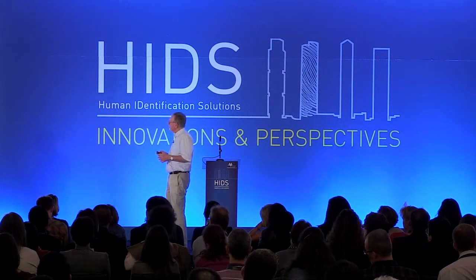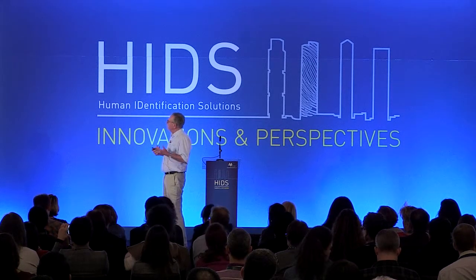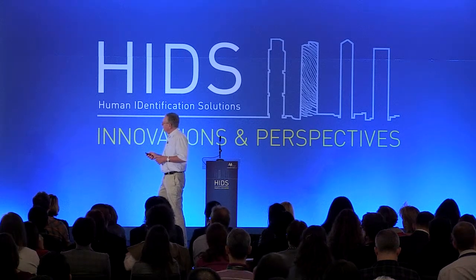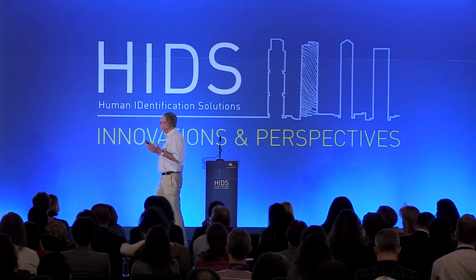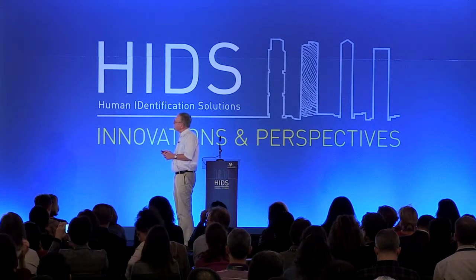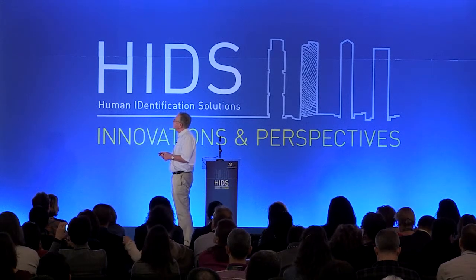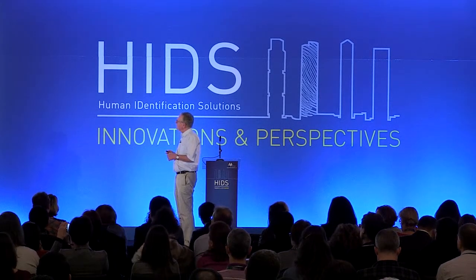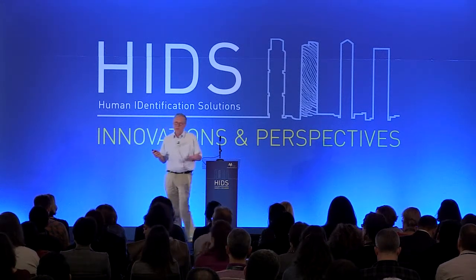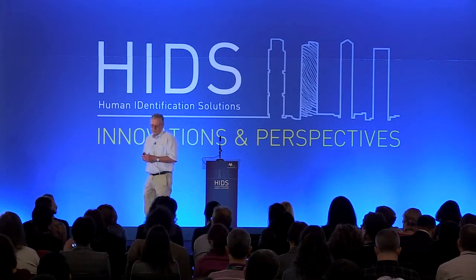So it's nice. And here are some other examples of the increased discriminatory power of these sequences. We made a small analysis of 3 very informative loci, and we realized that there was a great increase in the power of discrimination, the paternity exclusion power, and the typical PI. So it's really a good tool.